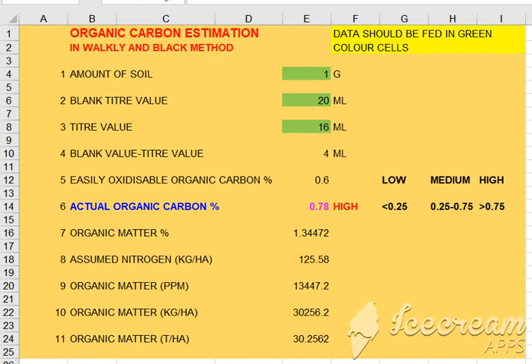This is the end point of the titration. In the soil, we have a blank titration. If you have a blank titration value, you can see a little titration value. You can see how much potassium dichromate will be digested in the soil.